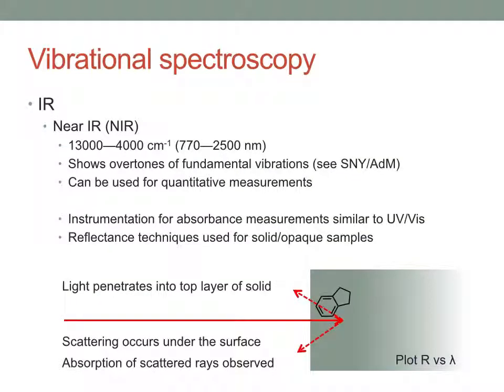So a different type of infrared we have is near infrared, which looks at higher energy, so looking much more just at just past red light. There are different types of near infrared instruments. Some of them work very much like an absorption instrument, and you put in a thin film of your sample. Others are looking at backscatter from a sample, which is a really, really useful way of going about it.